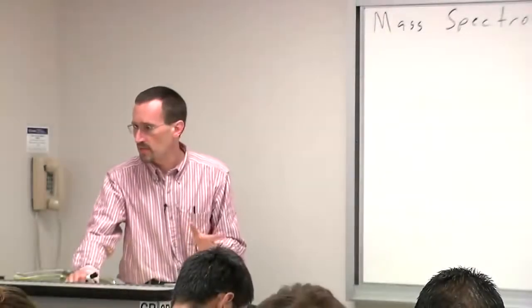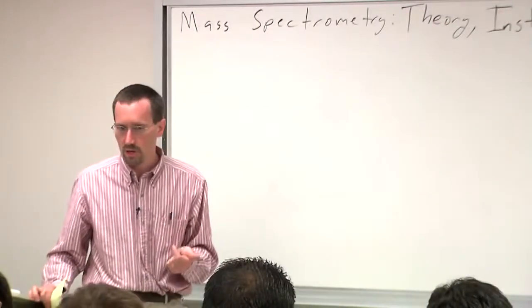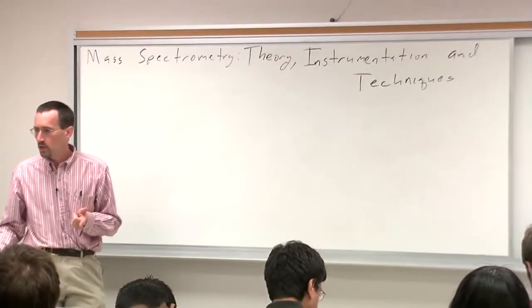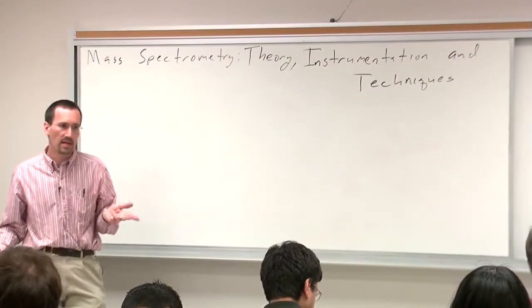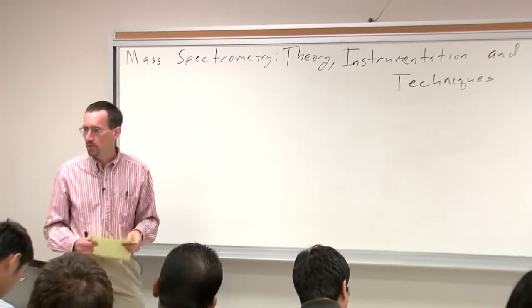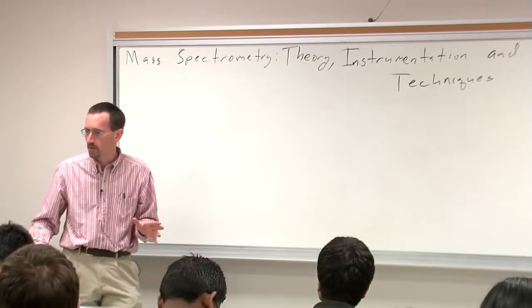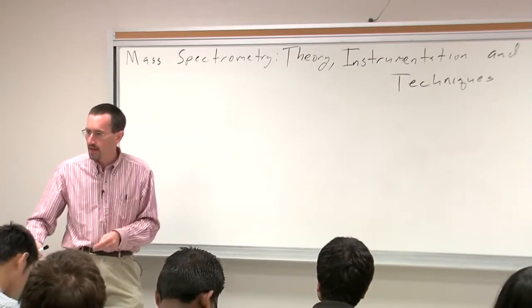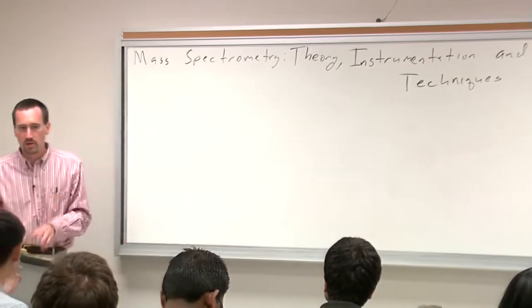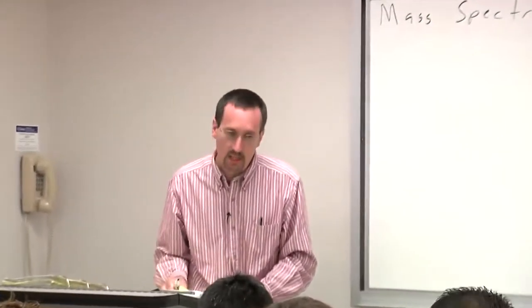To start talking about mass spectrometry, today we're going to talk a little bit about how the technique works. On our next lecture on Monday, we're going to talk about concepts, and then on Wednesday, we'll spend one lecture on EI fragmentation, which is kind of special topics. It used to be really, really central to mass spectrometry. It's sort of part of pedagogy that's carried on, but EI mass spec is the historical first in mass spectrometry, but is a lot less important these days.